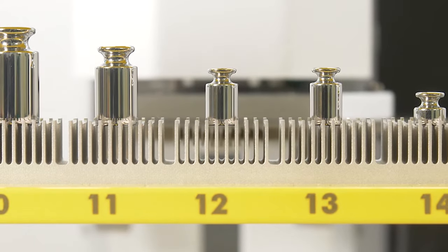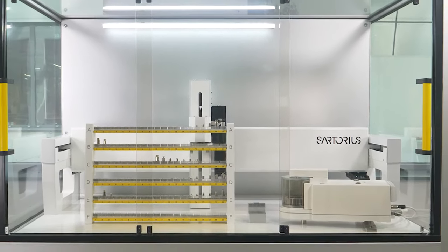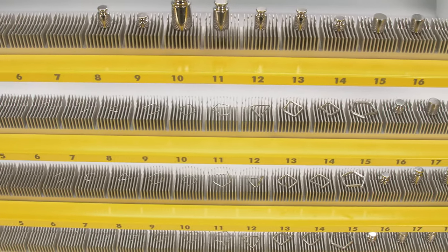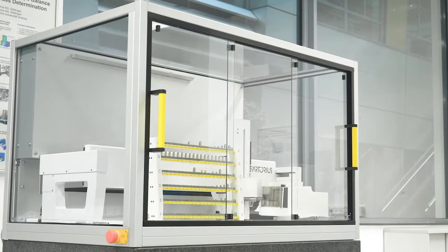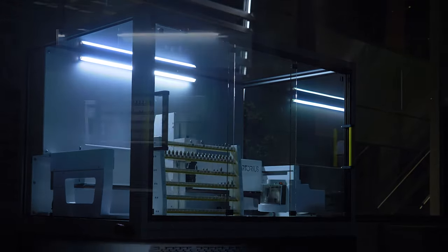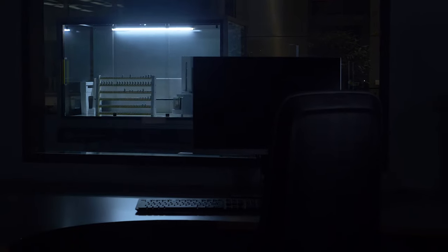The CCR compact robotic systems offer tabletop sized automated solutions for your mass determination or dissemination processes. With 120 magazine positions, the Sartorius CCR compact robotic systems offer a walkaway solution allowing continuous processing of your measurements day and night or over the weekend.